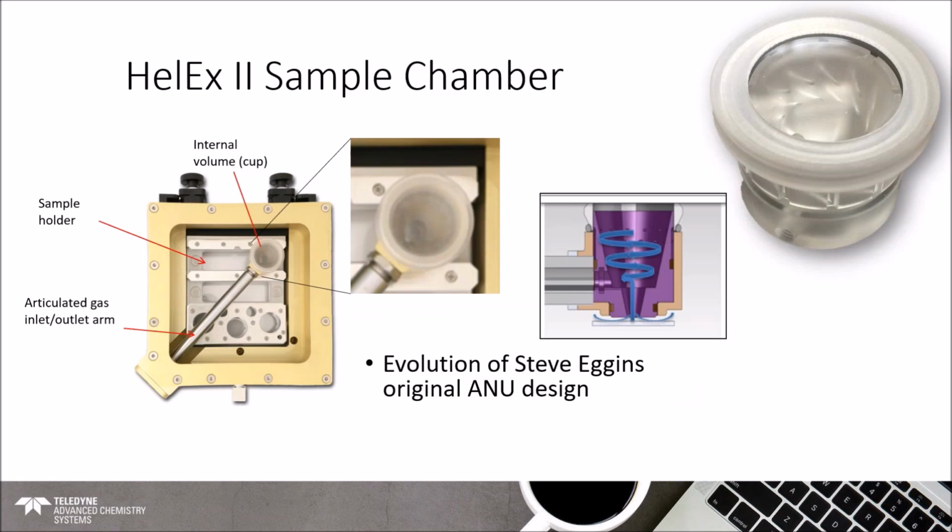Now I've pointed toward the sample chamber a couple of times, and I made reference to the fact that we'll do a whole history of sample chambers and the development process in subsequent seminars. For this one in particular, I'm simply going to show you what our primary sample chamber looks like on our Excimer systems. We call it the HelEx 2 sample chamber.